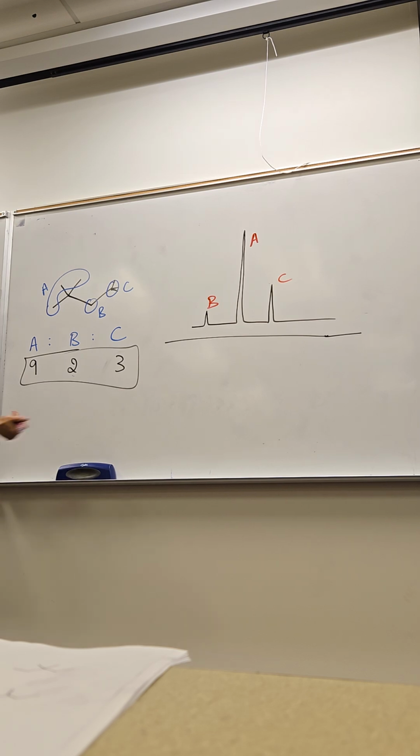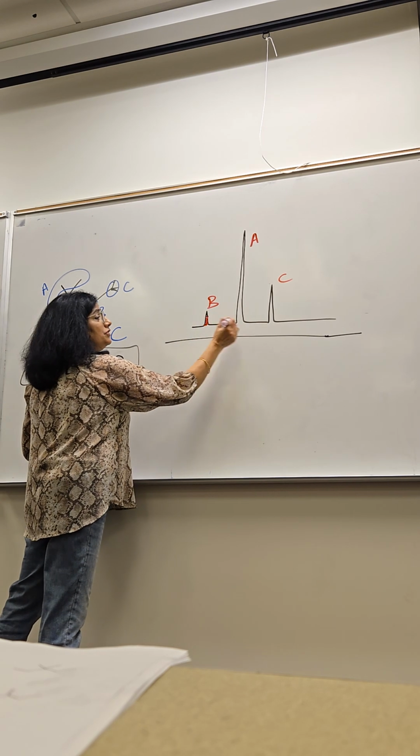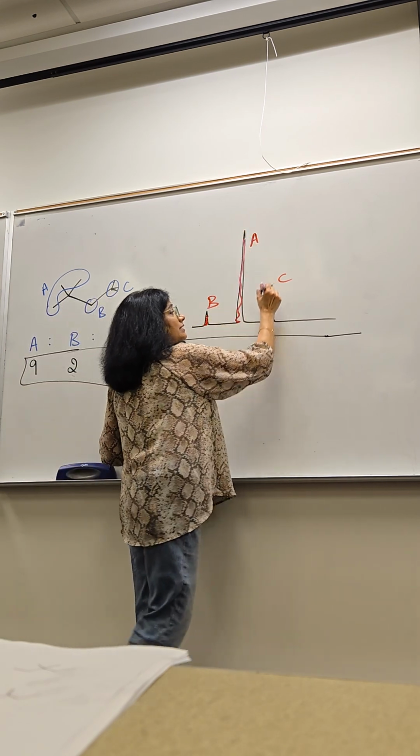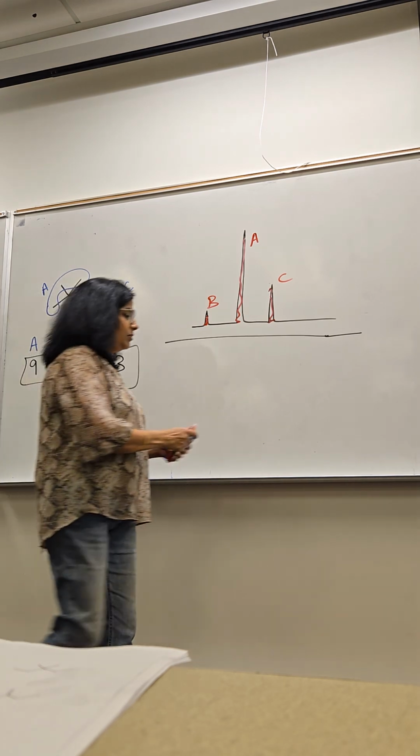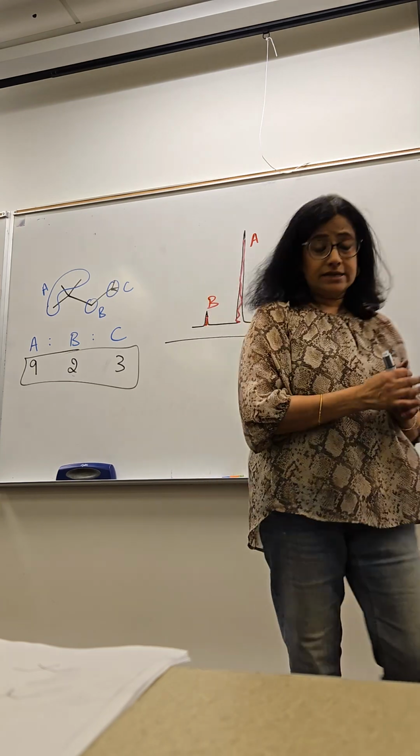All we are doing is looking at the integration of this versus this versus this, and noticing that's the biggest signal, smallest signal, and so on. Everybody okay? That's integration, basically. So let's do a couple more examples to understand.